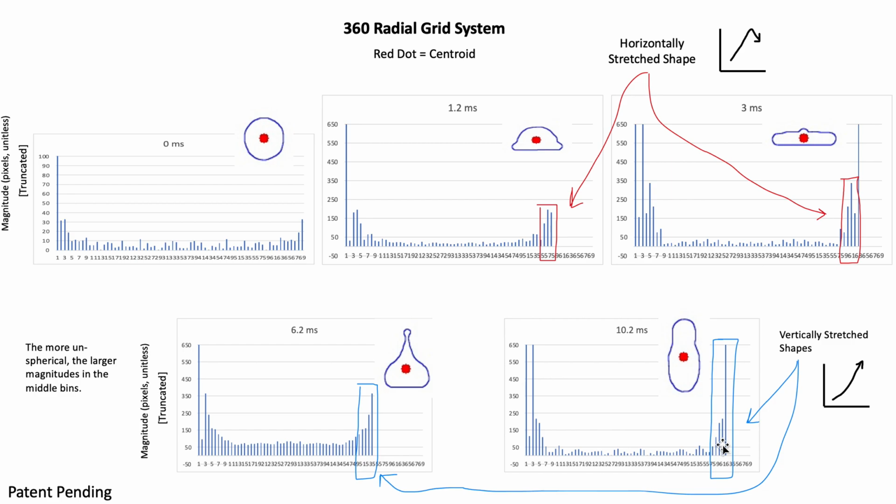That is for shapes that are vertically stretched, as in these two, you see this exponential increase in the last few bins. While for shapes that are horizontally stretched, the pattern is actually a cliff. You peak and cliff, as described up here in this graph. You see that peak and the cliff. So there are patterns that if you were to measure the continuum of shapes between each of these milestone shapes, you'd be able to quantify these patterns in the form of indices that show clear thresholds that define shape categories.